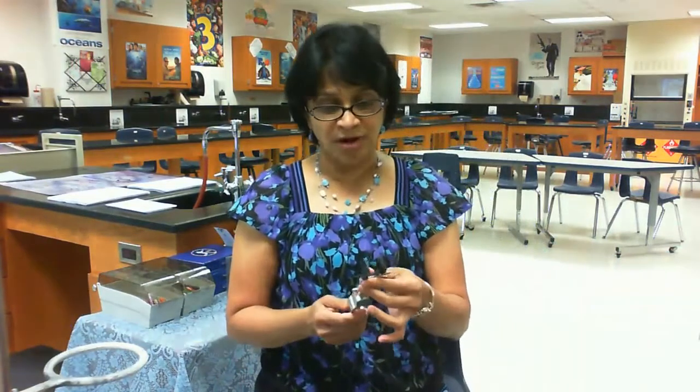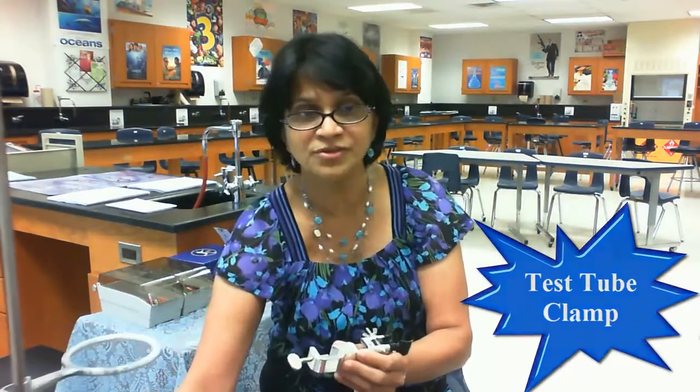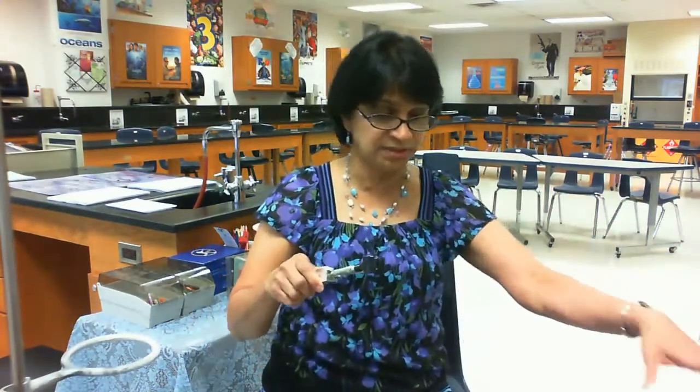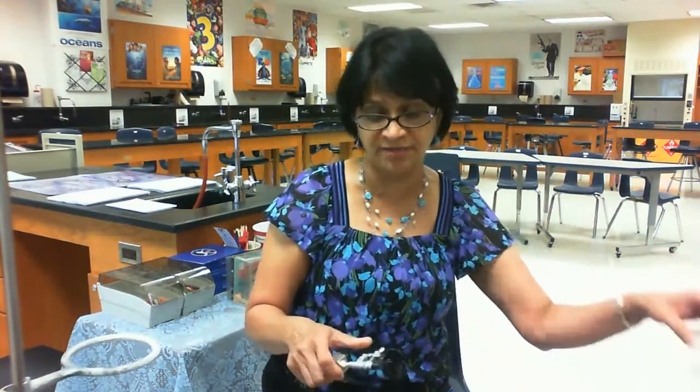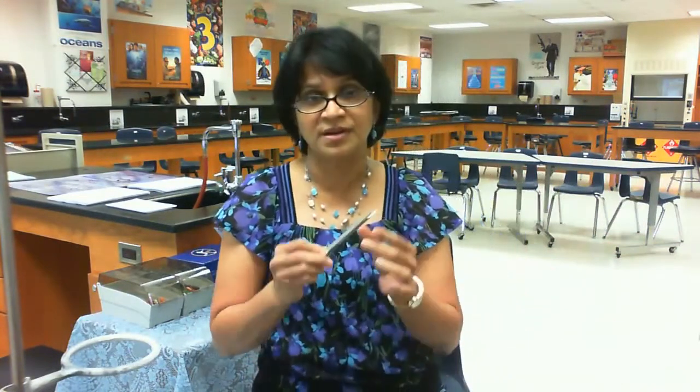If we want, this is a test tube clamp, and a test tube clamp can be used for having a test tube attached to the clamp, or we can also use this clamp with other equipment, like even the flask, we can clamp that. Then we have a spatula.